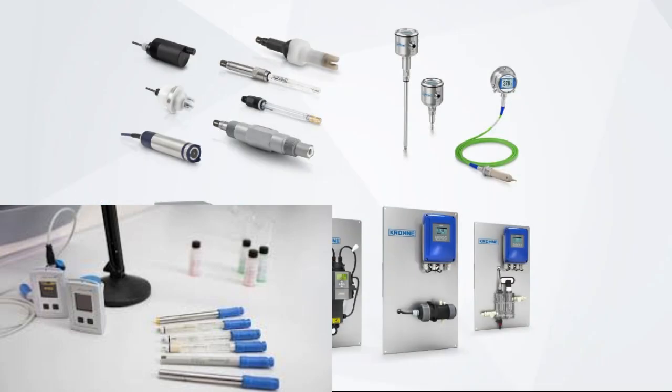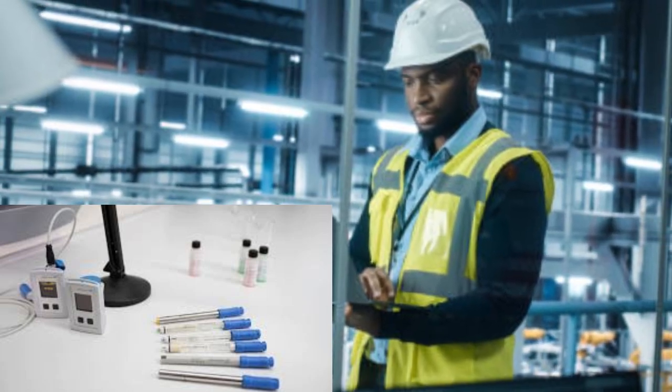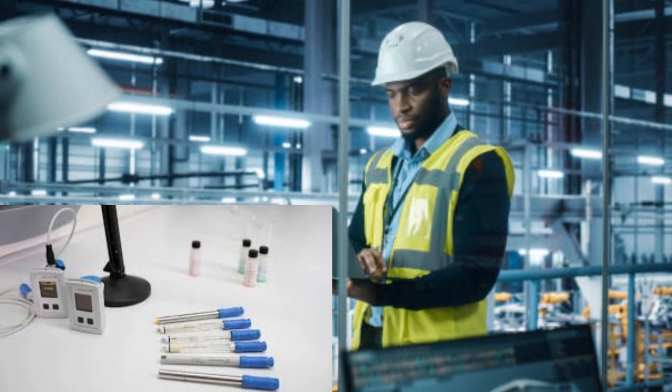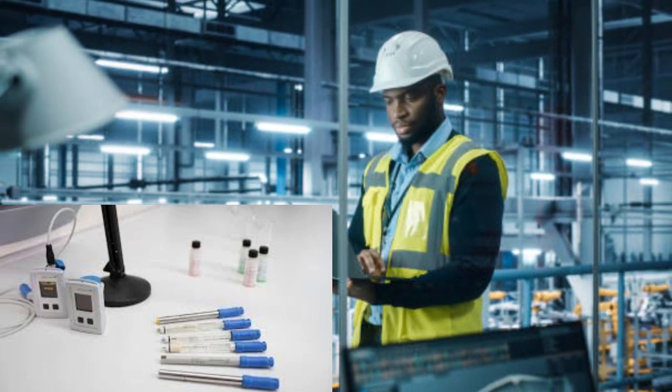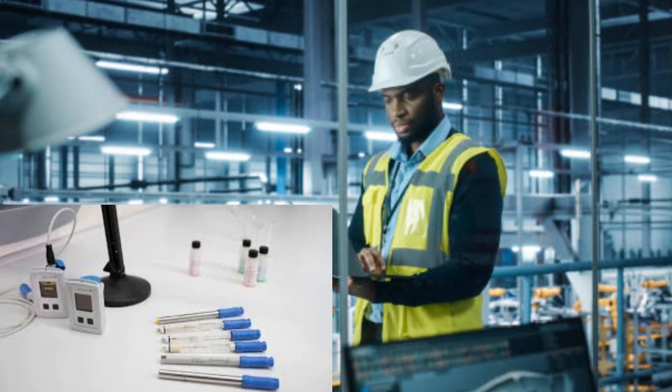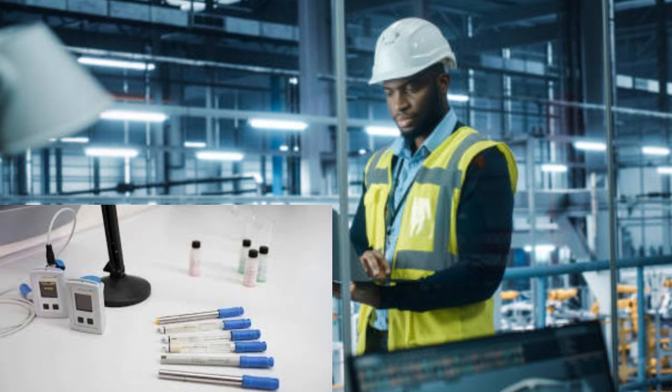But how do we know this sensor is giving us good information? What's stopping it from just spitting out a bunch of bogus numbers? That's where the solid state reference comes in. It's like every sensor has its own fact checker, making sure the readings are accurate. When they're calibrating the sensor, it gets married to its reference. It's a match made in accuracy heaven. Okay, that makes me feel better about trusting the data.